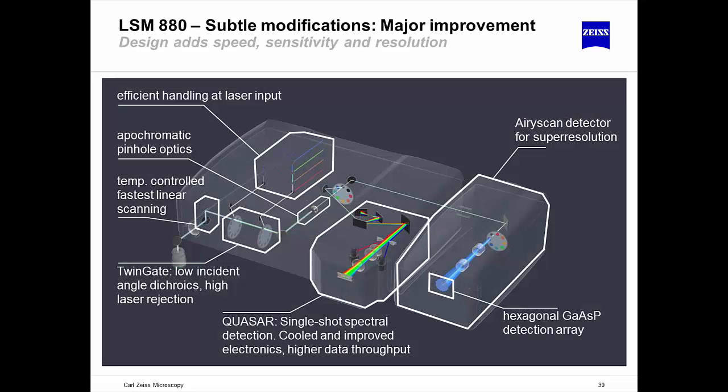If I put up this slide again, which runs through the beam path of the LSM 880, as an instrument developer, you spend your whole time looking at this beam path, dreaming about this beam path, thinking about how can we squeeze an extra few percent out of this and how to make it more sensitive. The problem is, over time, all of the easy challenges have been done, even all of the hard challenges have really been done on this light path.